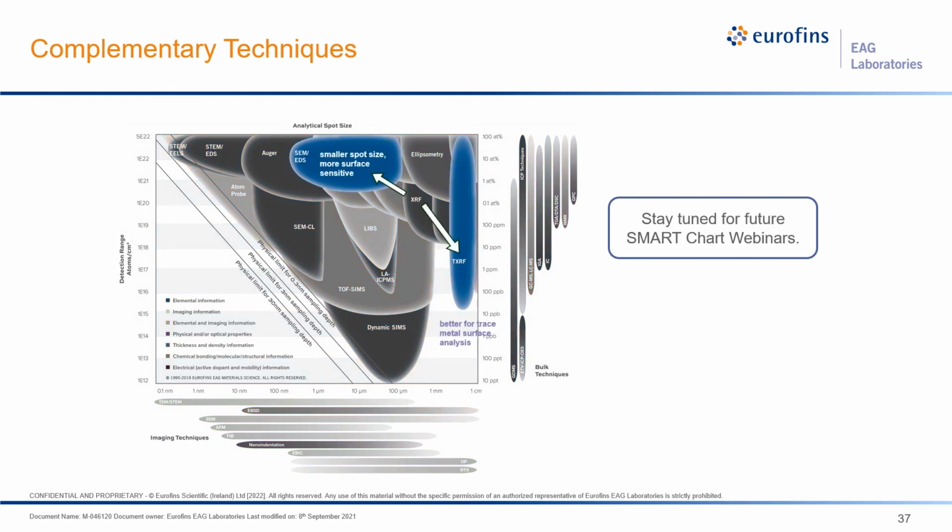I'd mentioned SEM-EDS as a technique that provides similar information as XRF, indeed in measuring the same fluorescence signal. While EDS is less robust for quantification, it has the advantage of being more surface sensitive as well as having a significantly smaller spot size.